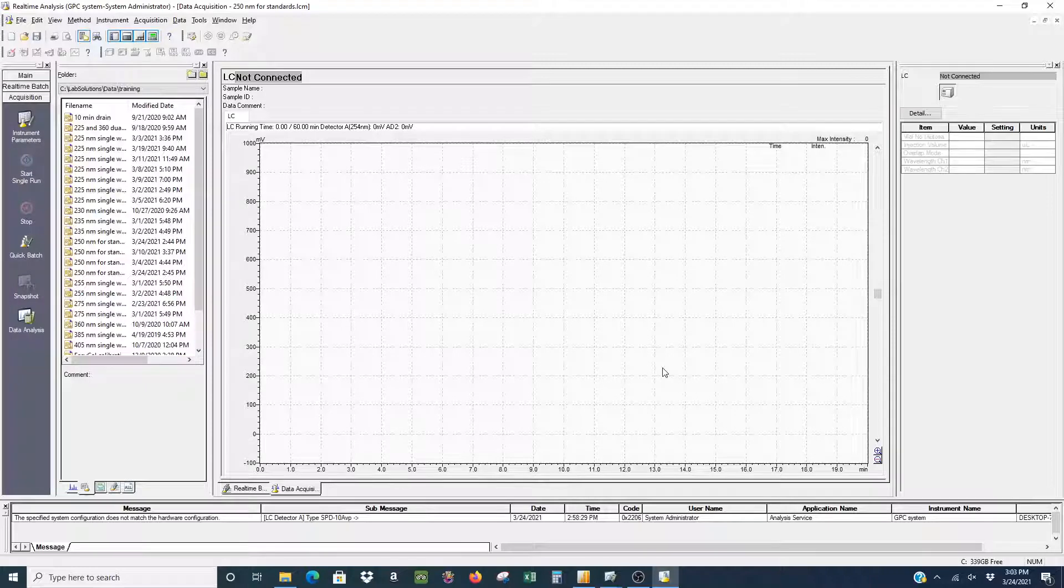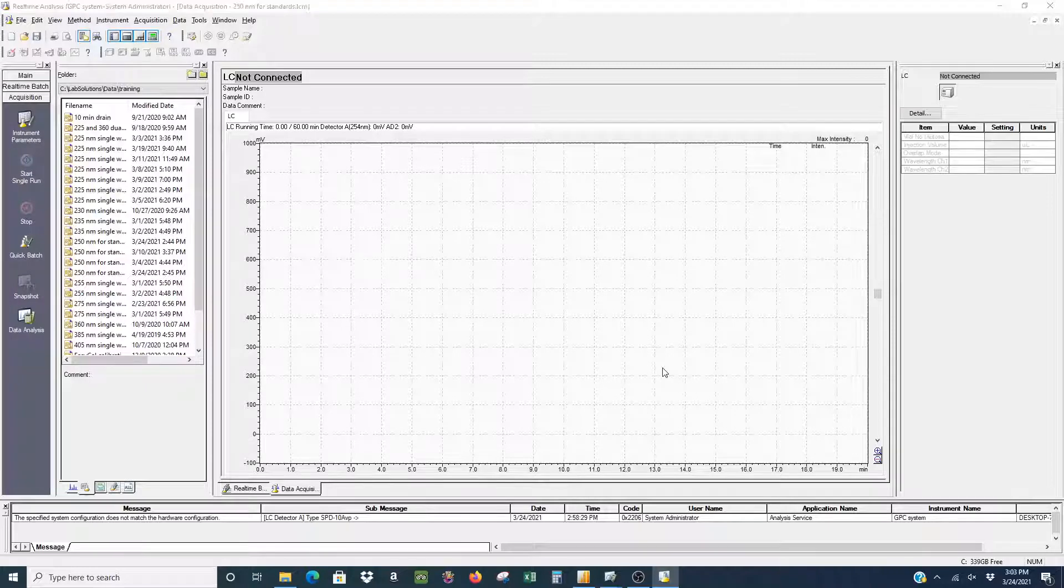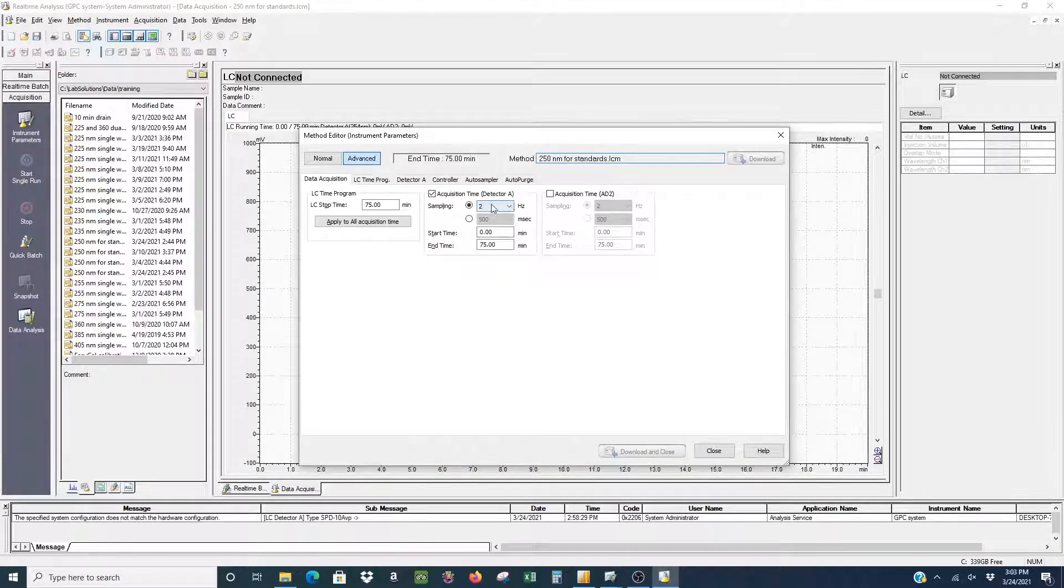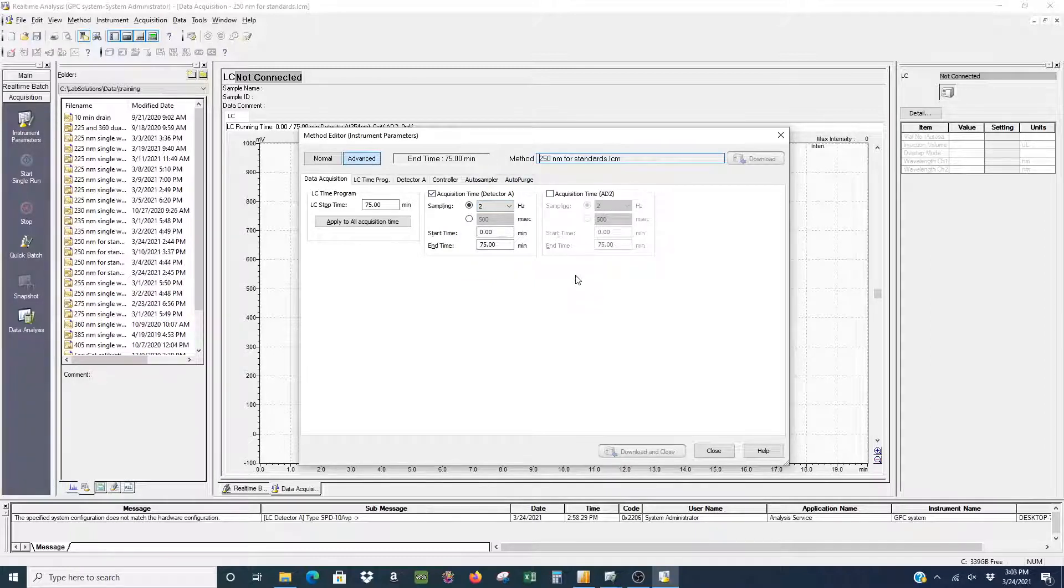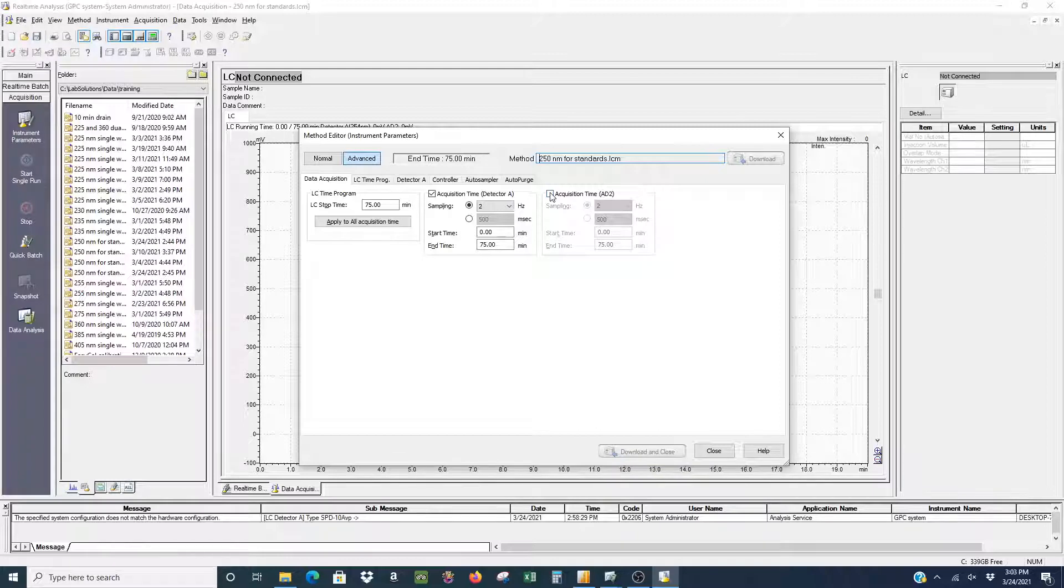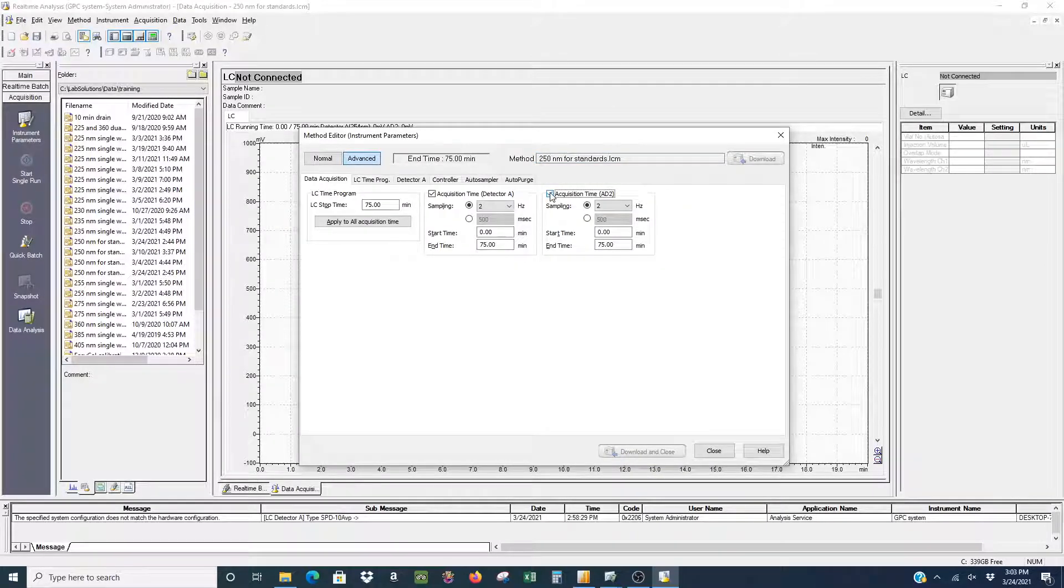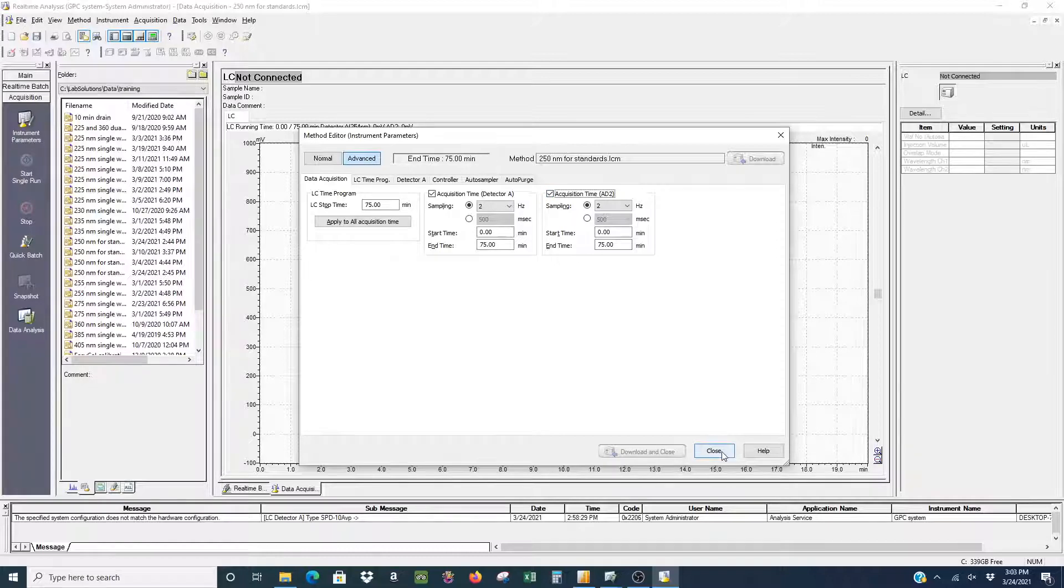As soon as you click that, it'll open up a pop-up window. You can see that we have detector A and detector AD2. Detector A is our UV light detector and AD2 is our RRI detector. If you want to use both at the same time, you have to make sure that they're both checked. Once they are, you can go ahead and close the window.